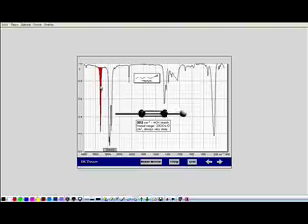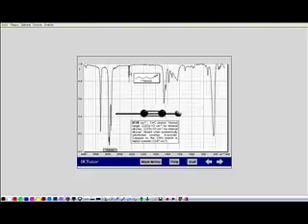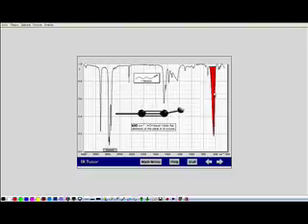If you just have a carbon-carbon triple bond, the carbon-carbon triple bond stretch you can see is very weak. It doesn't have a lot of intensity, and it's about 2,100 wave numbers. And then the rest of this stuff is, what do they call that? It's like a wagging motion. Literally from the dog tail wagging. So we got all these different motions for triple bond.